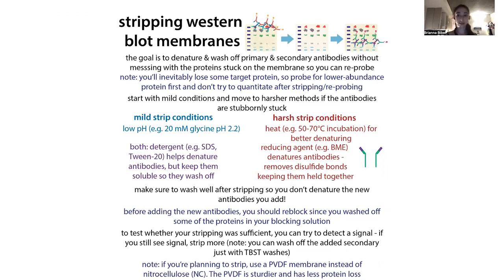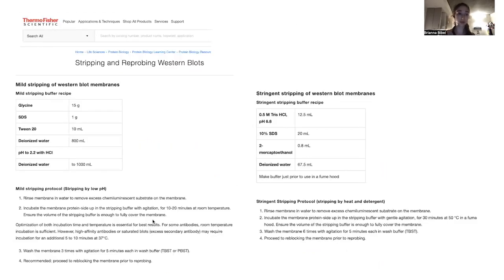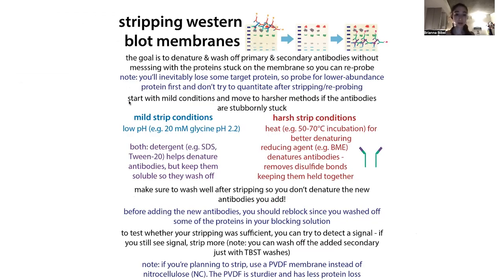Okay, so how do we go about this? So there are multiple different methods. I will go over the method that I used, which is I just got the recipe from the. This is not like a paid endorsement or anything. It's just this is what I used, and it's similar to other protocols that I've seen. So I use the mild conditions. So there's mild conditions and harsh conditions. And basically you want to start with the mild conditions. And if the antibodies just like aren't coming off, then you can move on to harsher conditions. But you want to start with those mild ones because you have to remember that you don't want to be disrupting your protein.